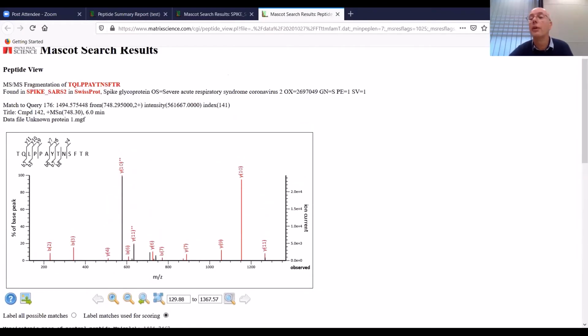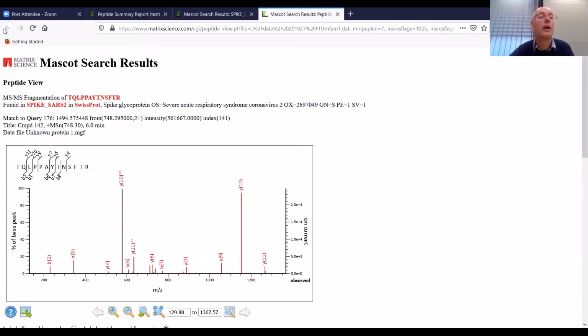Let's look. I'm going to get lost here now. I may need to reshare my screen. Any questions while we are covering this?